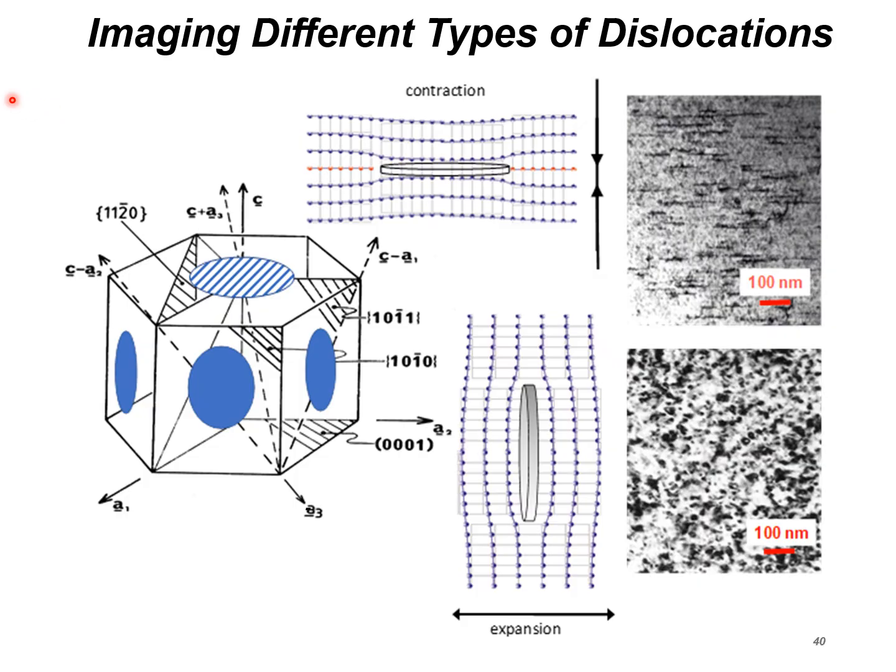I mentioned dislocation loops previously when it came to the mechanism of channeling. And that only occurs if the loops are glissile, if they're perfect loops. If they're faulted, that doesn't apply because they can't be subsumed into a glissile dislocation. But what do I mean by a loop?